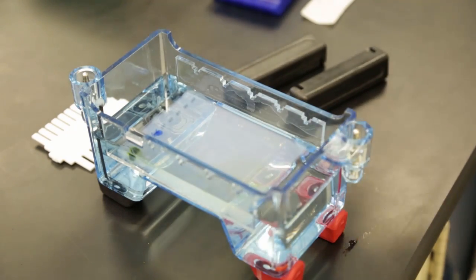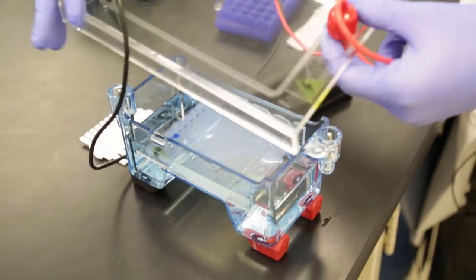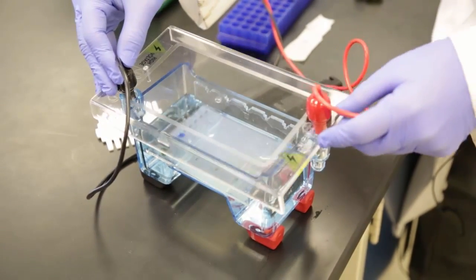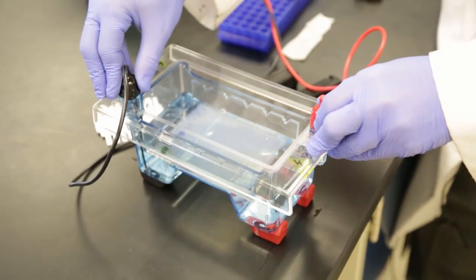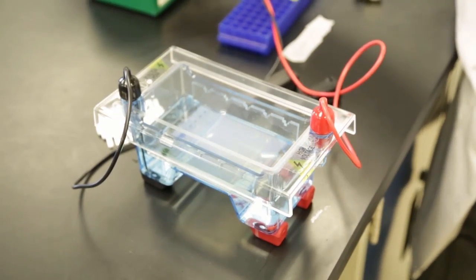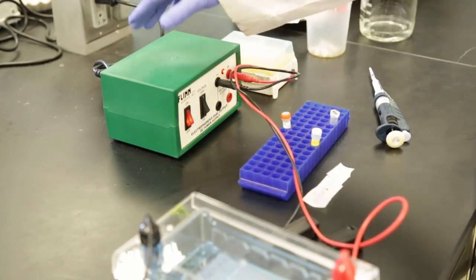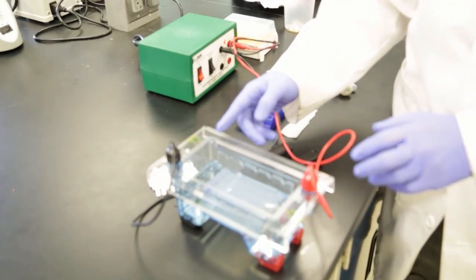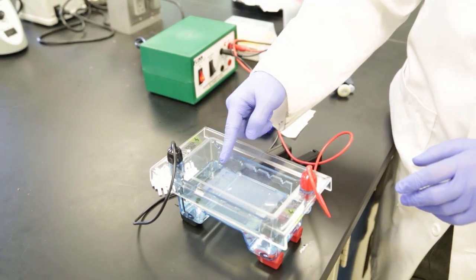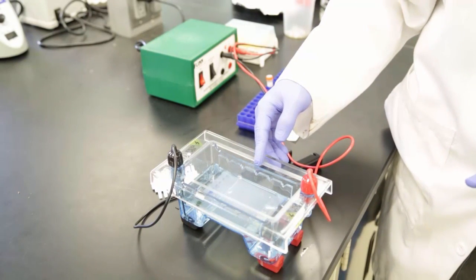I then take my gel box cover and connect it. So again, black with black and red with red. And then we turn on the power. And we allow this to run until the loading dye is approximately halfway through the gel.